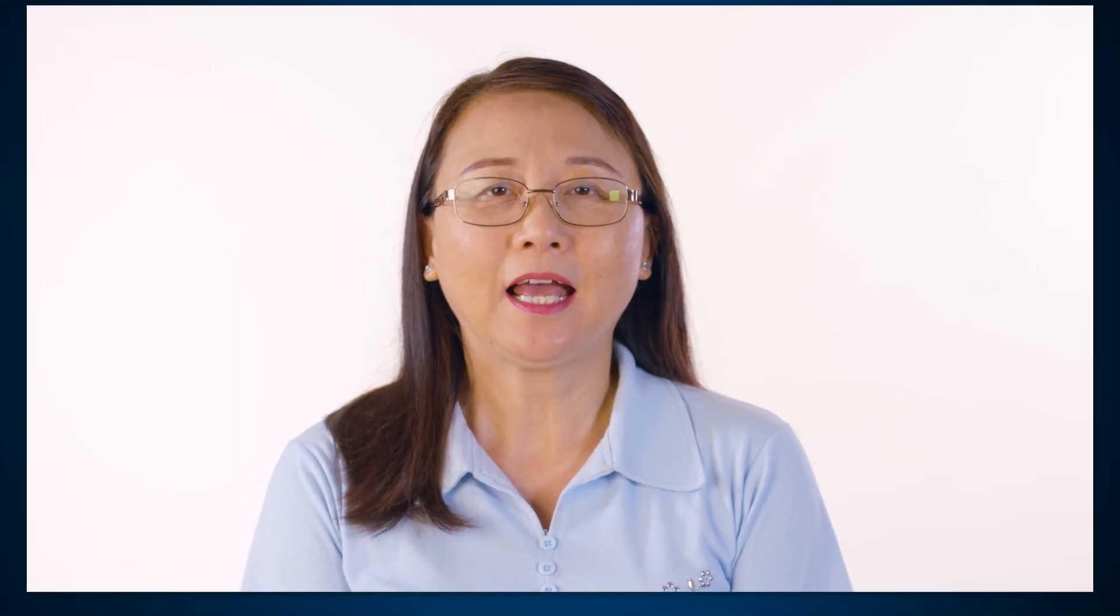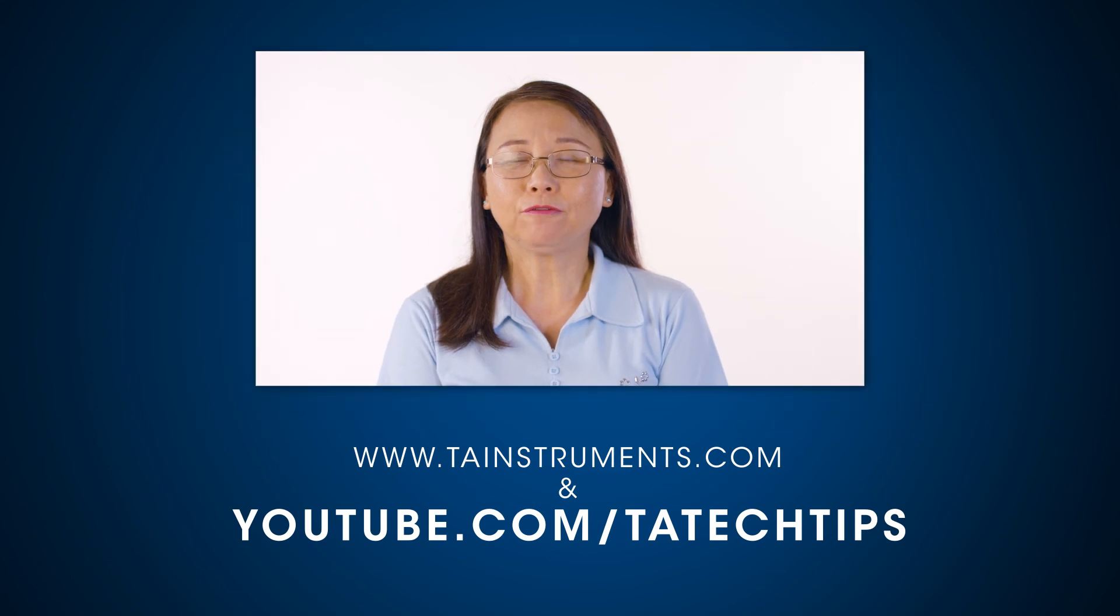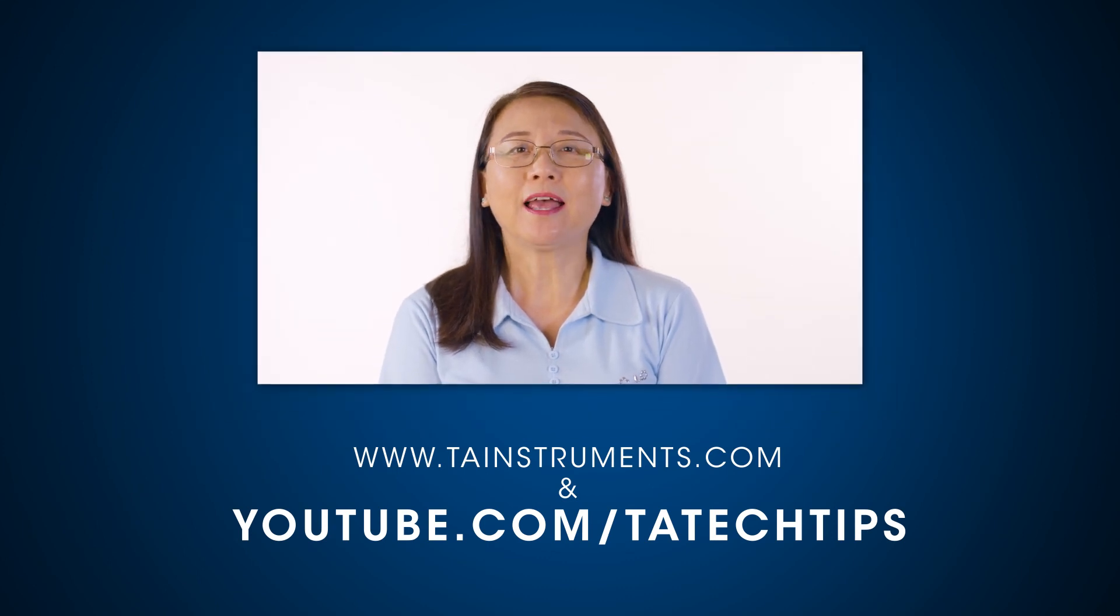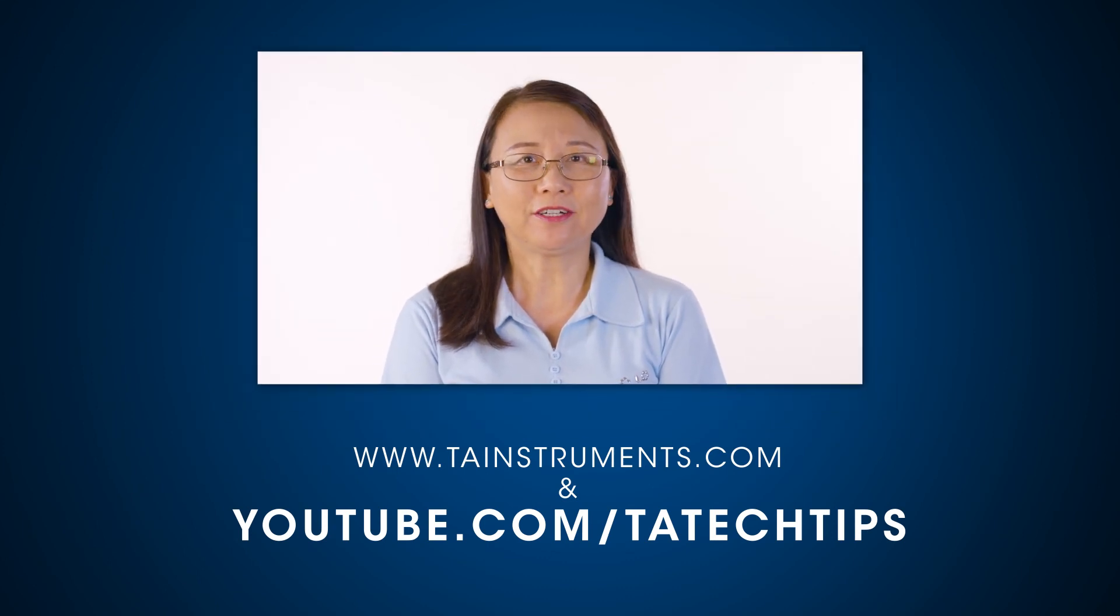In this TA Tech Tip, we have learned how to set up a compression geometry on the ARIES G2 rheometer for DMA mode testing. Please stay tuned for more helpful TA Tech Tips and thank you for your interest.